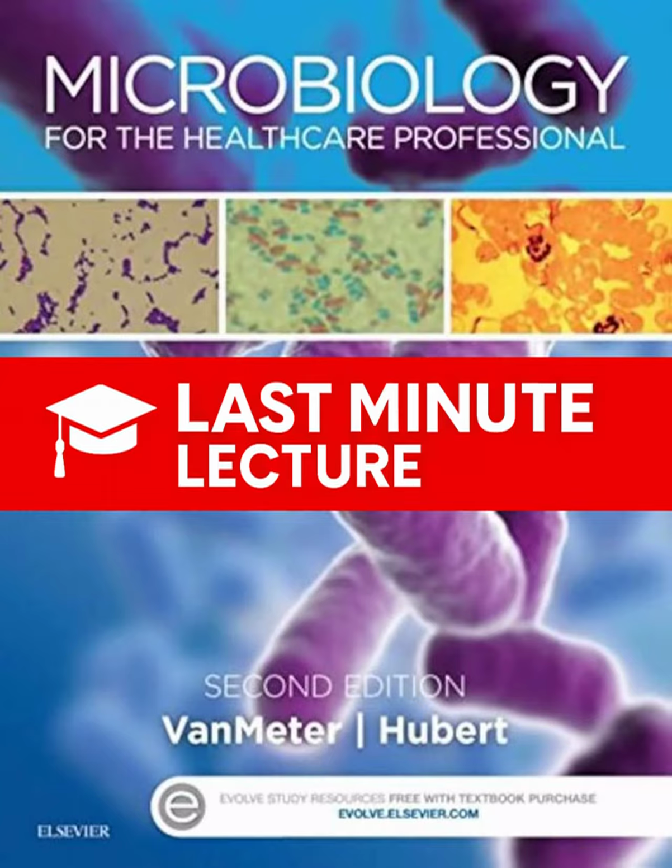Clever. Okay, beyond physical state, media can have specific jobs, right? Enriched, selective. Right, functional types. Enriched media has extra goodies added, like blood, serum, special growth factors. It's for growing picky organisms, the ones that won't grow on just basic stuff. Blood agar is a classic example. And selective, does that mean it selects for something?